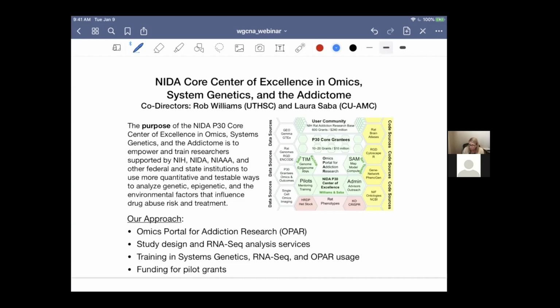Right. Oh, one last thing that I think is really important for people to think about, because you see a lot of variation in this in the publications using WGCNA, is the actual number of samples that are used in the analysis.